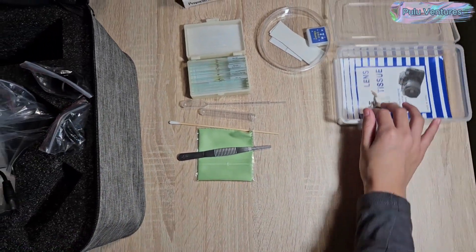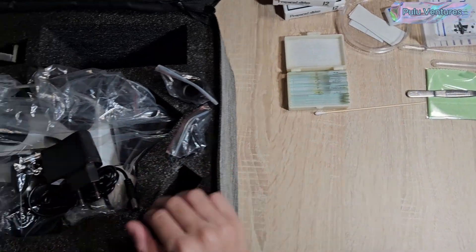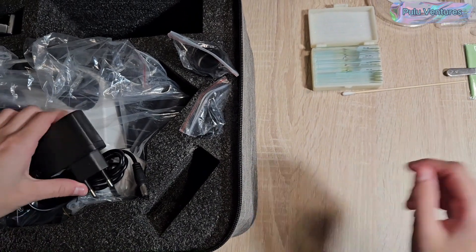Also included is a box with prepared slides and object holders to use in our investigations, and a box with forceps, swab, liquid extractor, labels, culture holders, and tissue cleaners.